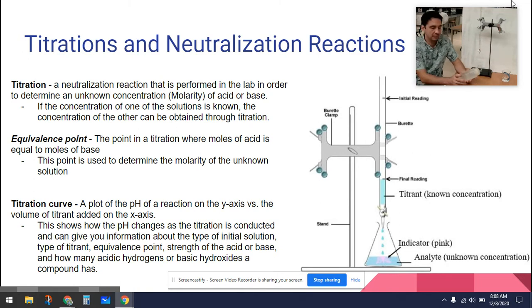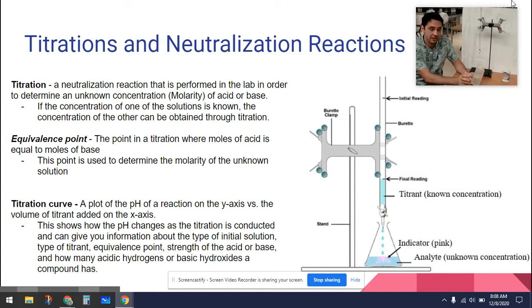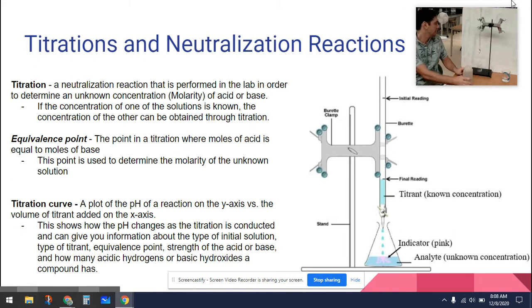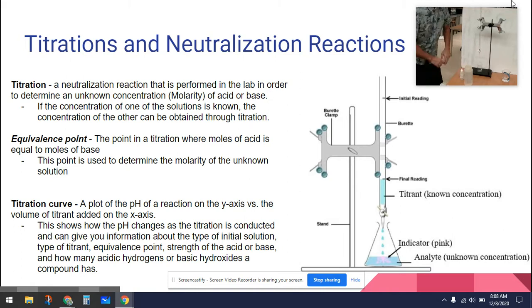So here we have some hydrochloric acid. I know the molarity of this, but let's say hypothetically that we don't know the molarity of this HCl solution — we know it's hydrochloric acid but we don't know the molarity of it.